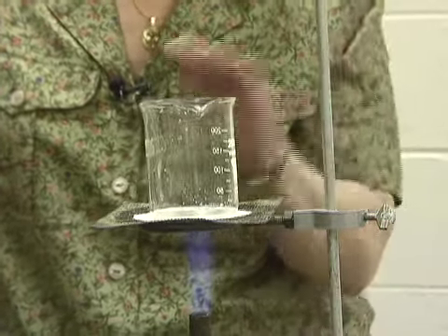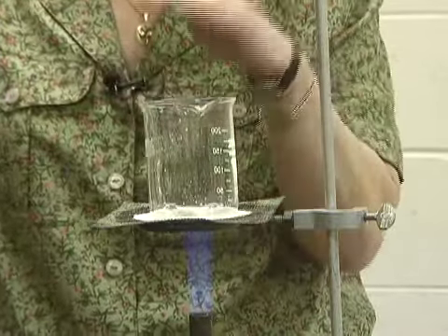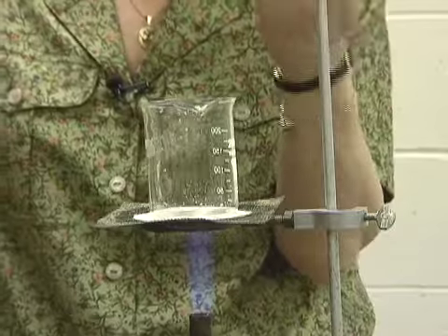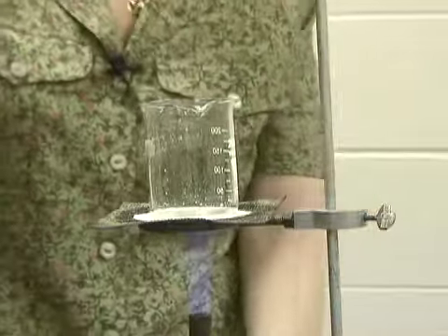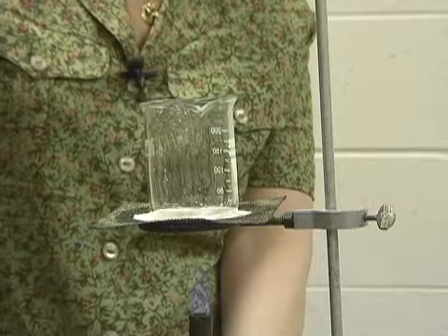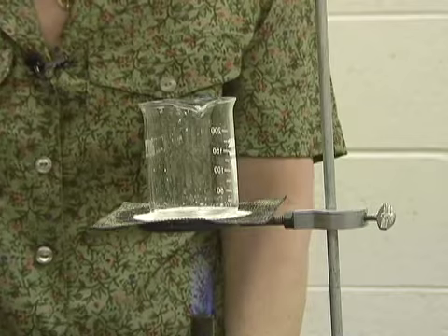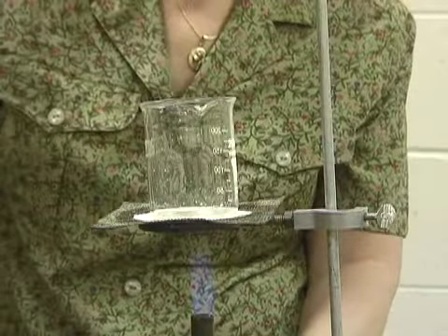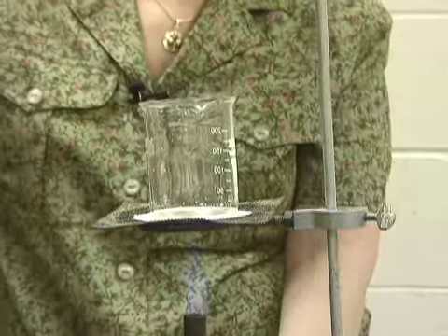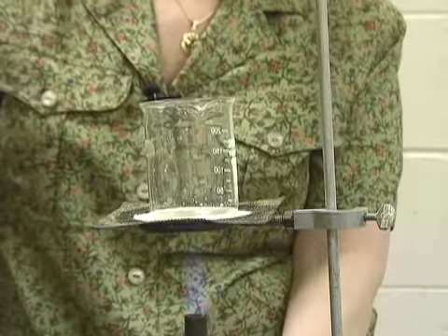Sometimes we put a watch glass on the top, and then if we have the mass of the watch glass, we can subtract not only the mass of the beaker, but the mass of the watch glass from the compound, if we were very concerned about the splattering. And I am somewhat concerned. I see some crystals on the side of the beaker. I turned down the Bunsen burner heat, so it's not too much.